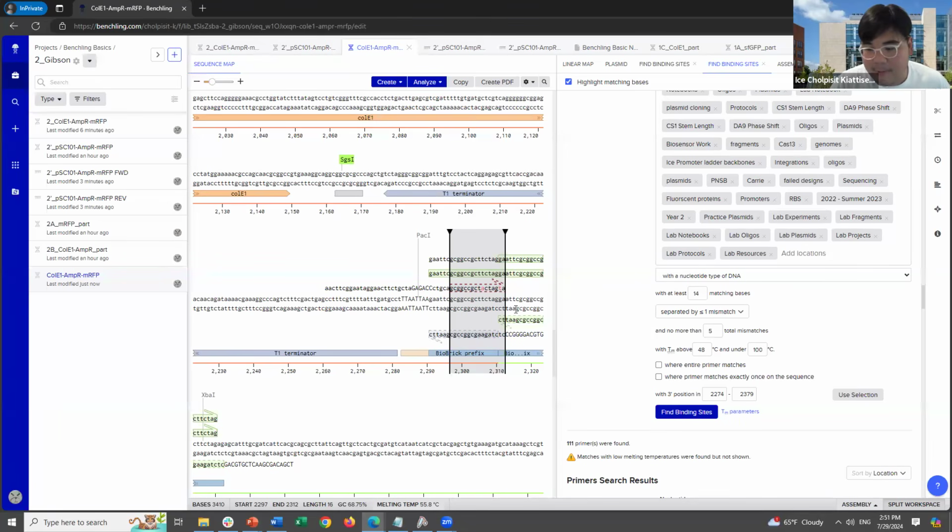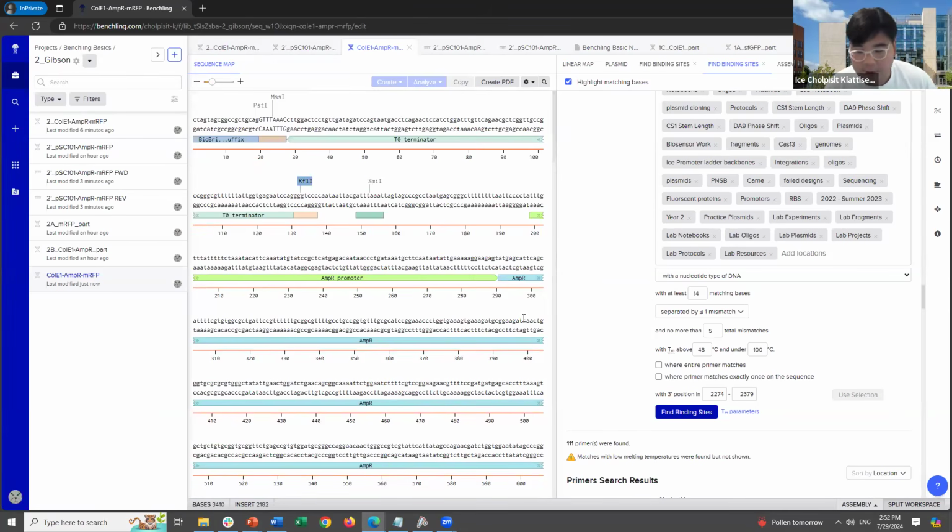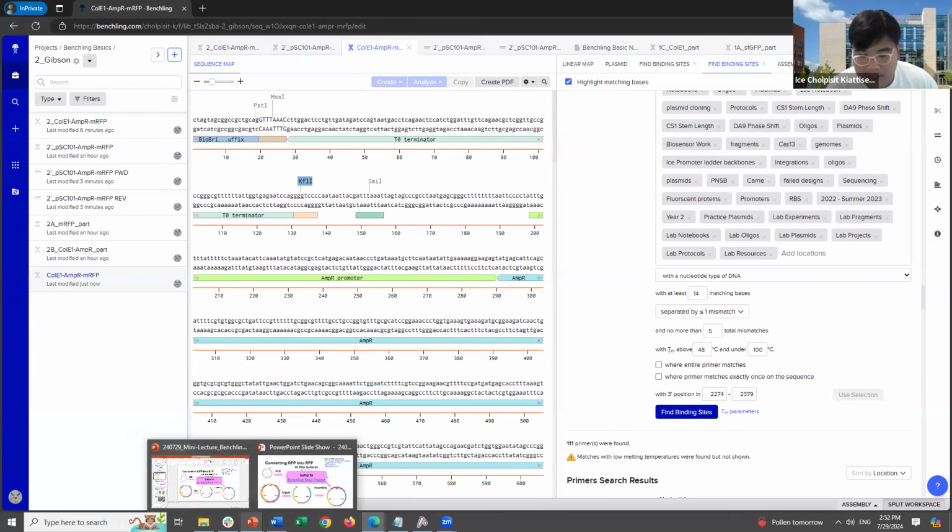And I think this is one of the strengths of the cloud, because you can find something that your friends or teammates have, so that you can borrow those parts and use them right away without reordering. So you're not wasting your money and your time on some of these common parts, for example. All right, so that's it for the assembly using the Gibson or overlapping-sequence based method.